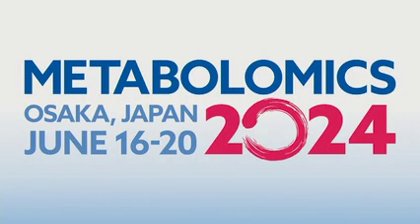But we're still working on this, and maybe also from a CSV format, so that you can just give boundaries for retention time, maybe also ion mobility. It just comes with the multi-dimensional space that we're covering. It's sometimes a bit tricky, but yeah. Thank you.